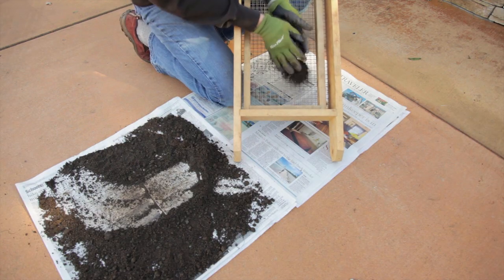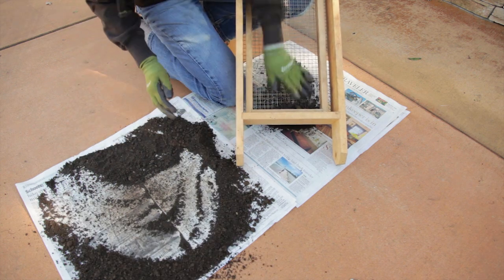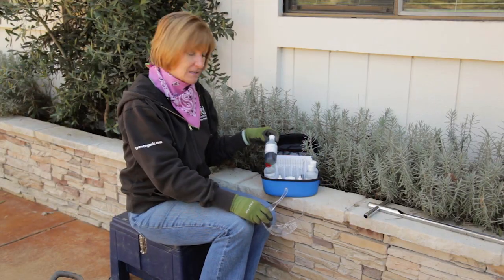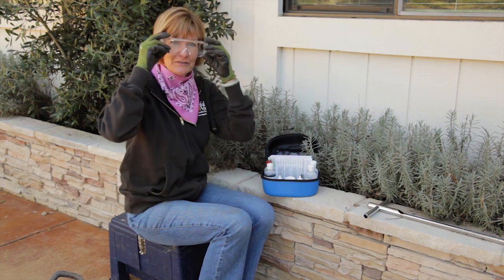Crush the soil and sift it through a sifter or a screen to get an even texture, and remove any debris or rocks. I'll be using the LaMotte soil test kit. Be sure and read all the material safety data sheets and follow the instructions very closely. Some of the reagents can irritate your skin or eyes, so be sure and wear your gloves and your safety goggles.